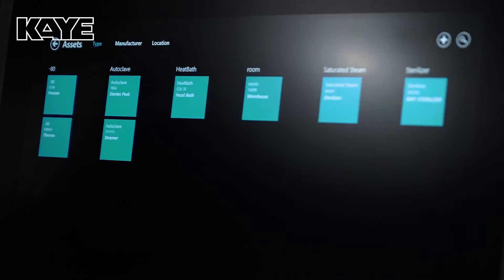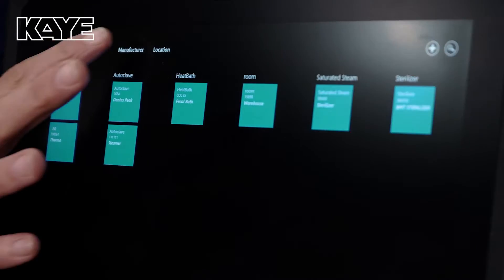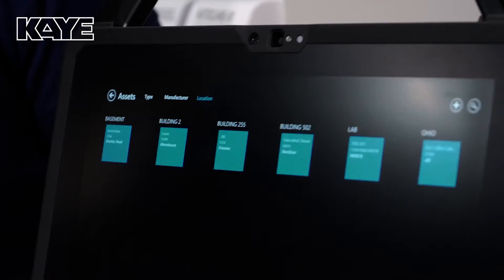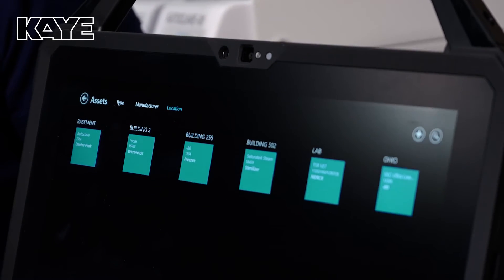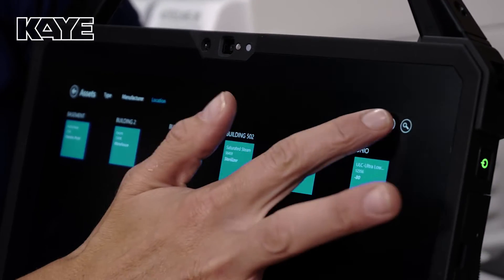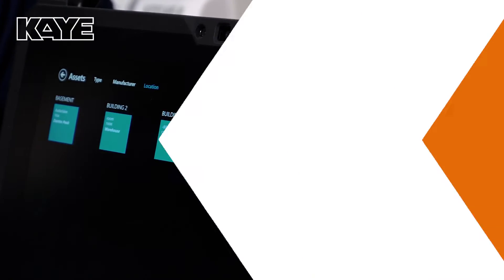You can sort by type, manufacturer, location, and adding an asset is very easy to do by just hitting this plus sign.